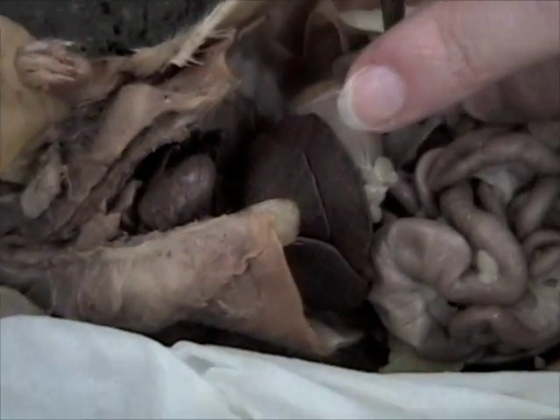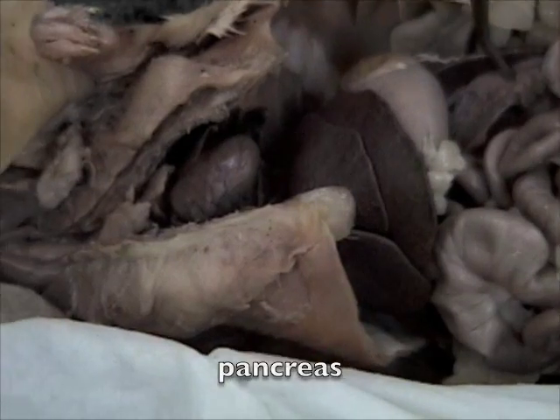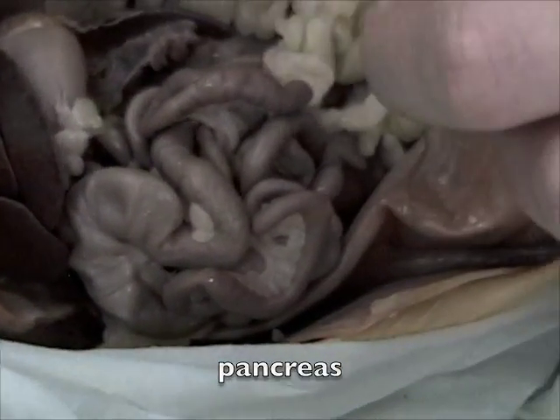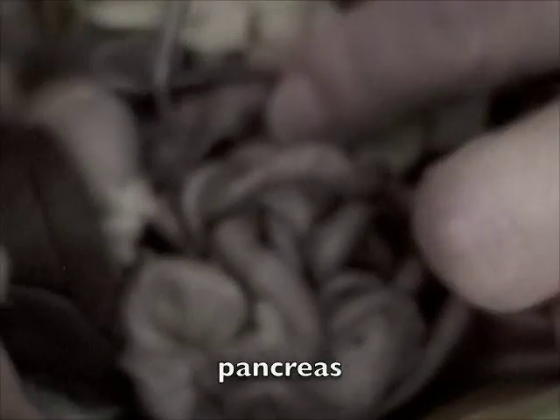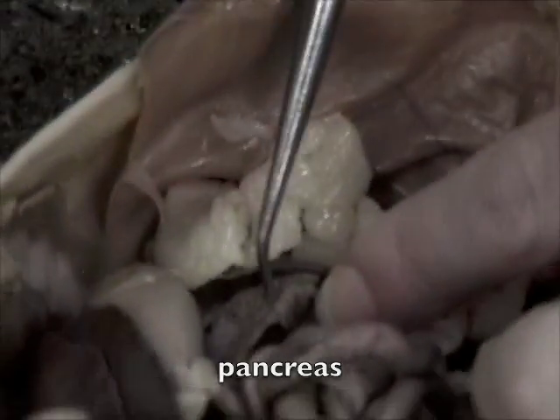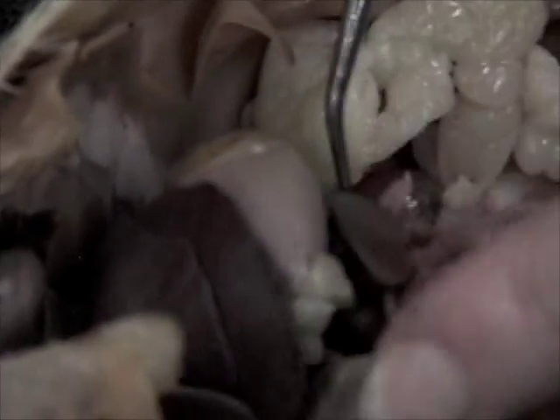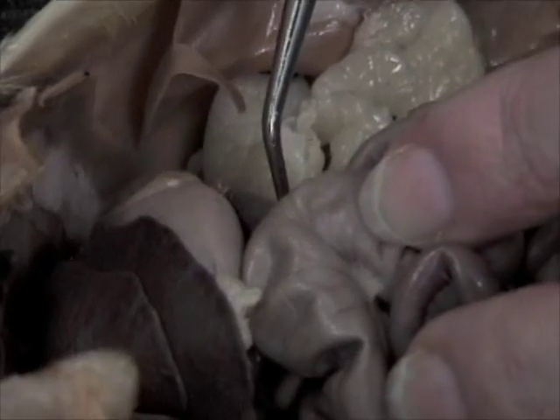So this is the spleen. See that spongy material right here? That is the pancreas. The spleen is this flap right here.